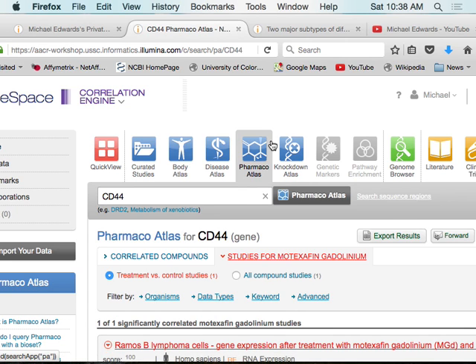What I wanted to show you is what we did with BaseSpace: we searched just by a disease. That first thing we did, we didn't even have our data and we found the gene list. We uploaded our own gene list and explored that, and we can use other gene lists too. Then we found an interesting gene, and we used this software to explore what's going on with that gene. This works on all kinds of different levels.